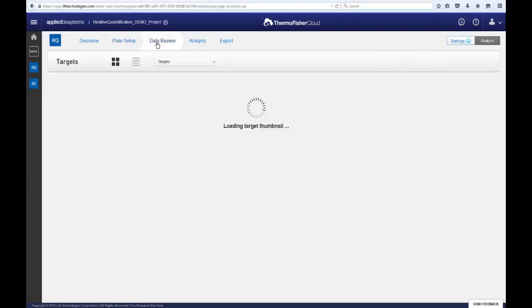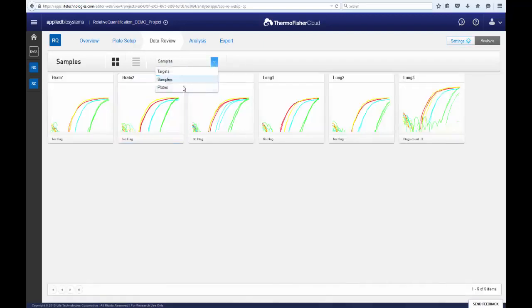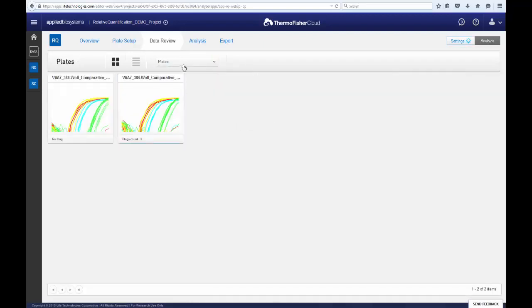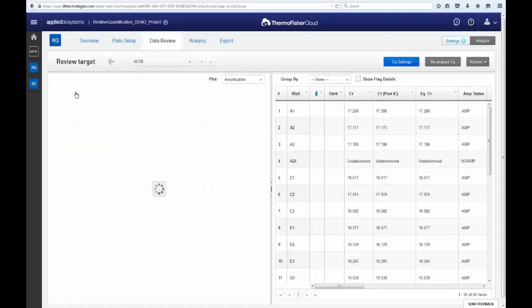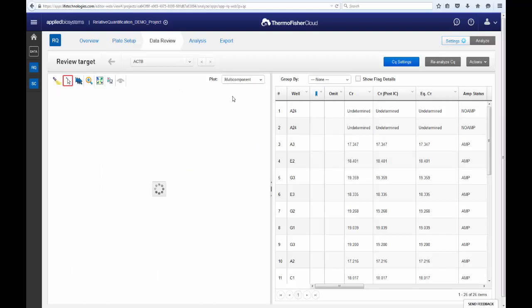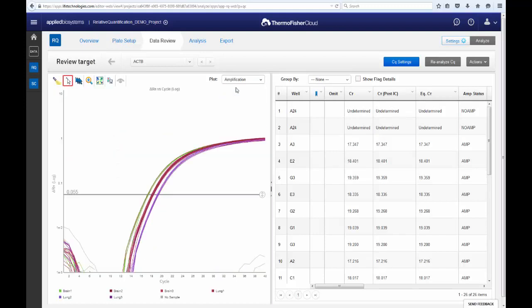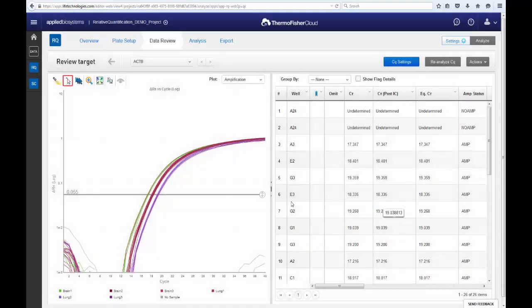In the Data Review tab, you can view your data in more detail by target, sample, or plate. The data can be visualized through various plots such as the amplification plot and the multi-component plot. Then you can manually adjust the threshold as you see fit under CQ settings or by dragging the visual in the plot.